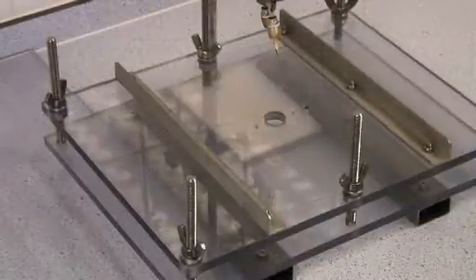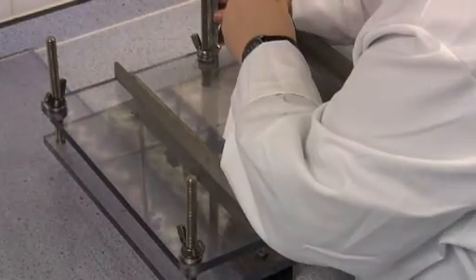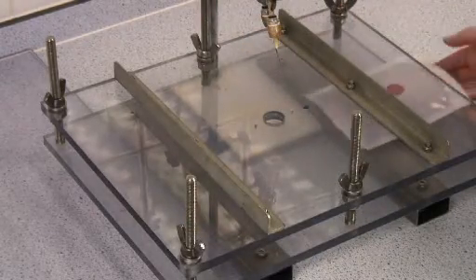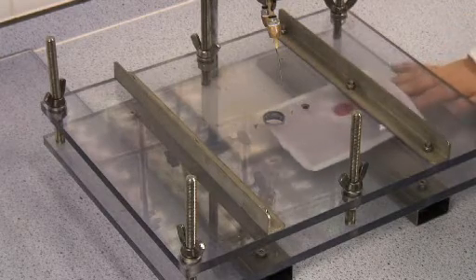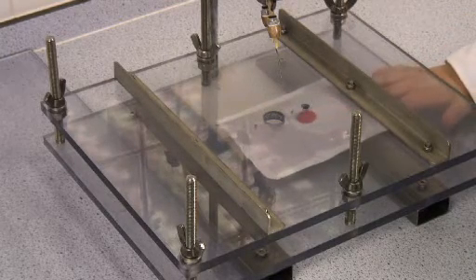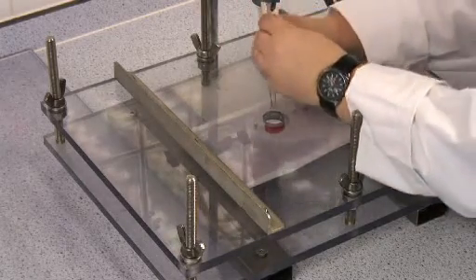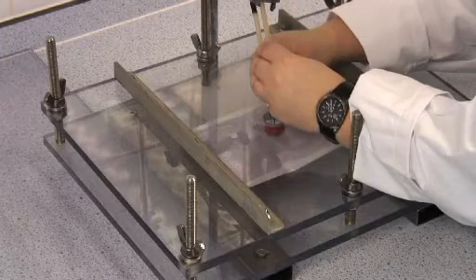Burst testing is used to determine seal strength and a pack's ability to withstand transportation and handling. It's particularly used for retort pouches and tray and liding applications. We would expect clients that produce retort pouches or plastics to use this test, along with manufacturers of ready meals and retort processed foods.